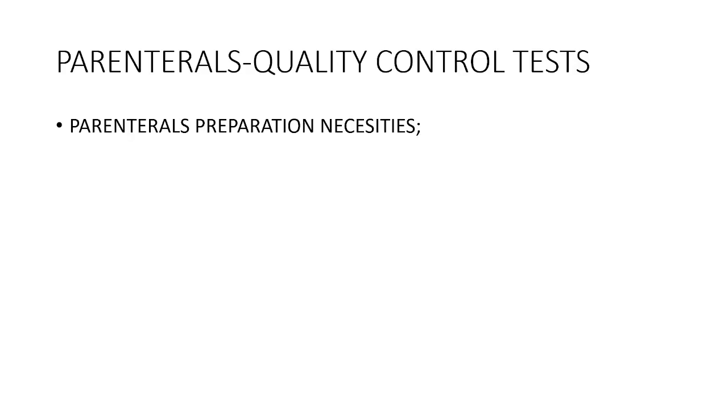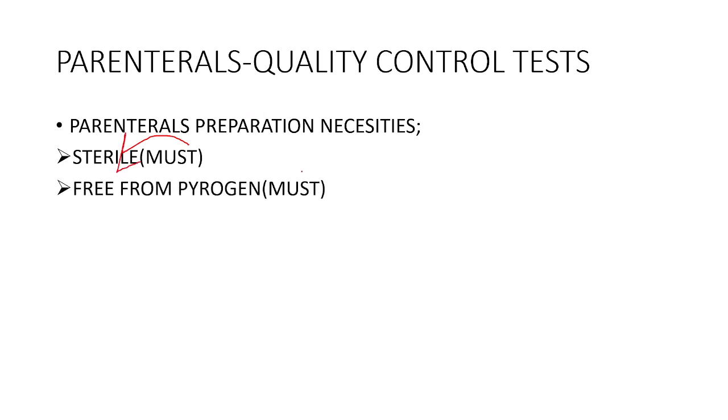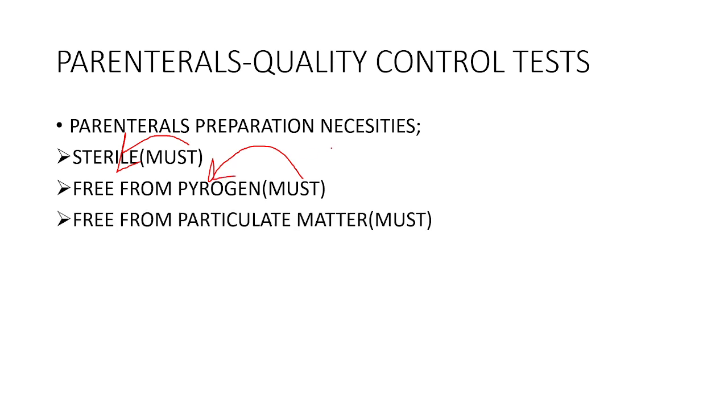So now the topic is quality control tests for the parenteral dosage forms. What are the necessary requirements for the parenteral dosage form? It must be sterile. Next, it must be free from pyrogen. Next, it must be free from particulate matter, nothing but any foreign particle.